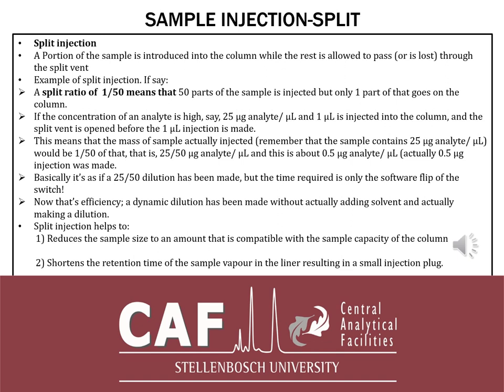they will be separated. For instance, I've always asked a question in the interview: I give a chromatogram with a lot of peaks which are not resolved to baseline, and I ask, is that one peak or is that two, more than one peak? Any answer can be one peak, it can be two peaks. And I say, but how will you determine if it's one or more than one peak? The answer will be either dilute the sample and run again with splitless, or run a split. So what I'll do, I'll introduce a split. If that peak resolves into a nice peak shape, then it's one. But if you're seeing two, three peaks resolved, then from there the next thing will be to dilute the sample further.